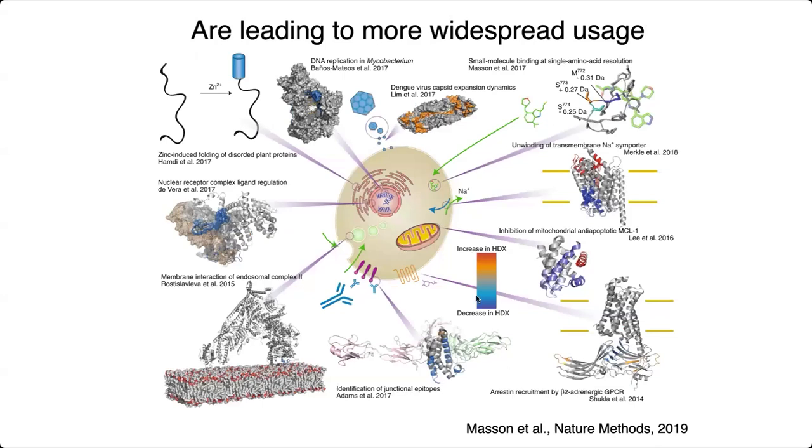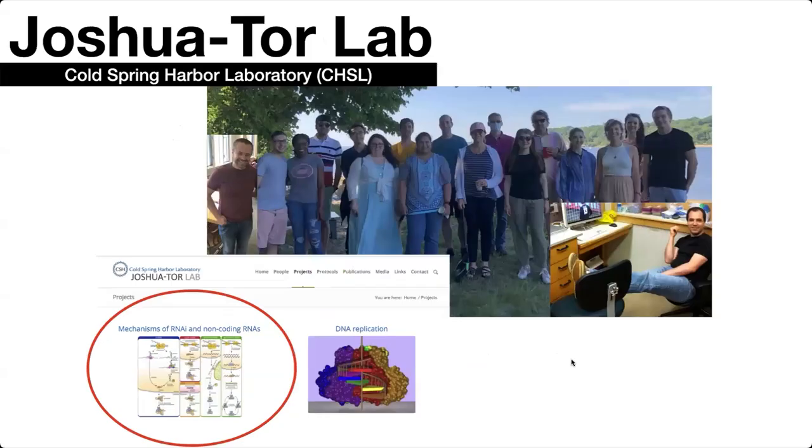Hopefully HDX-MS will become more widespread. It's used in a variety of different experiments, analyzing a variety of different proteins, things like receptor binding, looking for unwinding of symporters and small molecule binding, and expansion dynamics of the dengue virus capsid. So just some really cool stuff. And so, another great review article you can look at.